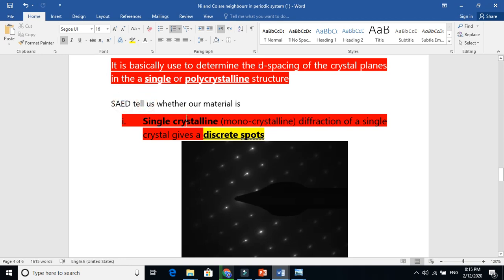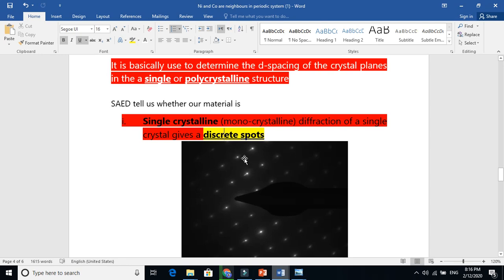Number one: single crystalline or monocrystalline. In a single crystal, the diffraction gives discrete spots. Why? Because in a single crystal, all the atoms are in the same order throughout the material. So the diffraction will occur at one particular point. There is no diffuse pattern or rings because all electrons deflect at that particular place.